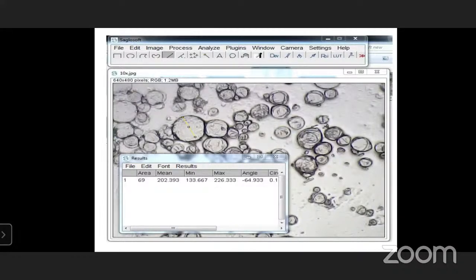वन ऑफ द मॅन्युअल प्रॉब्लेम काय आहे की डार्क फील्ड मध्ये जेव्हा तुम्ही ऑब्झर्व करता फिल्टर घालून त्यावेळेस काही पार्ट ब्लॅक मध्ये दिसतो आणि काही पार्ट अगेन इट शोज अ ब्राईट फील्ड. म्हणजे असं स्लाइड मध्ये एका अर्धा अंधार आणि अर्धा असा उजेड दिसतो. पण नो वन कॅन जस्टिफाय वेदर इट इज अ ब्राईट फील्ड मायक्रोस्कोपी or dark field microscopy. So that particular problem we observed every time. So that's why we developed another algorithm or particularly software coding for the dark field microscopy.